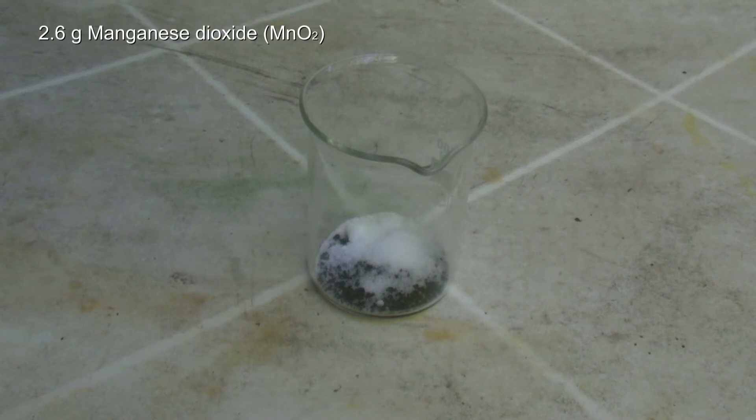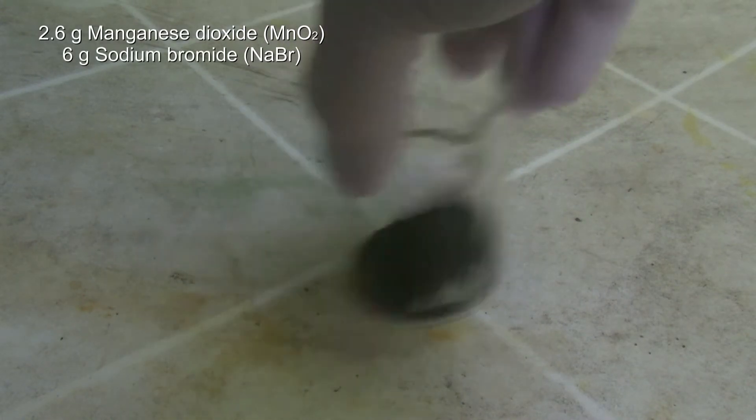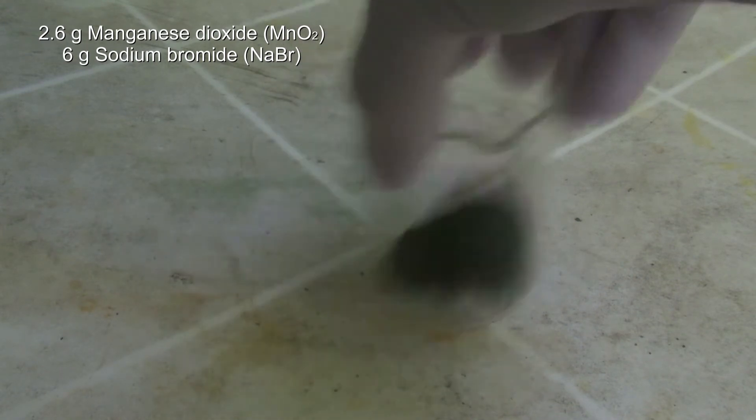At first, 2.6 grams of manganese dioxide and 6 grams of sodium bromide are weighed out in a beaker and mixed by swirling.